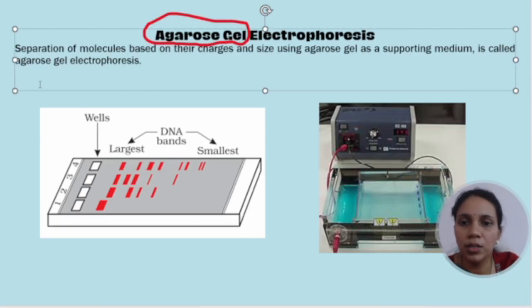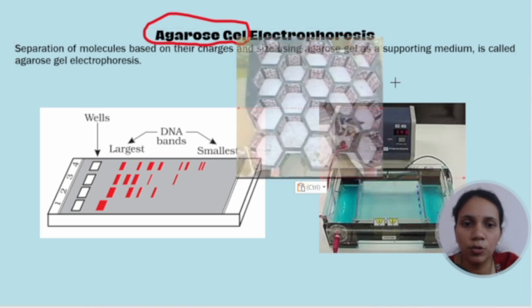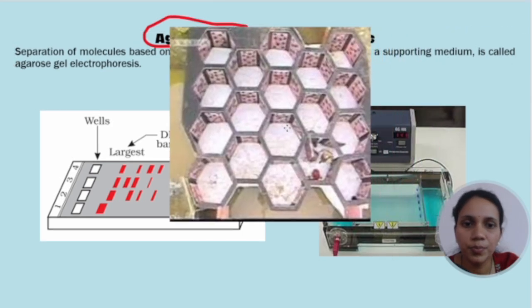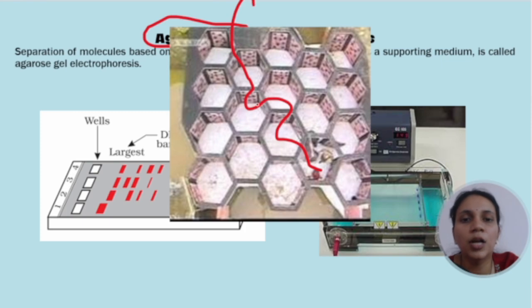So this is the example of that. You must have seen this. So a person has to move through these doors and pass. Finally that person has to reach the destination. Suppose they have moved here. So wherever the door is present, they have to move out. This is what happens in the case of your electrophoresis.